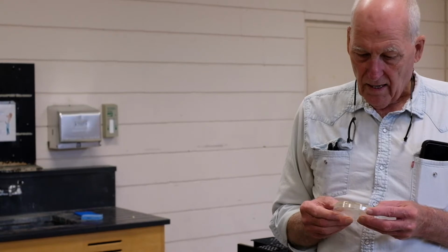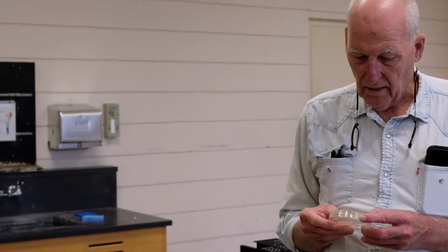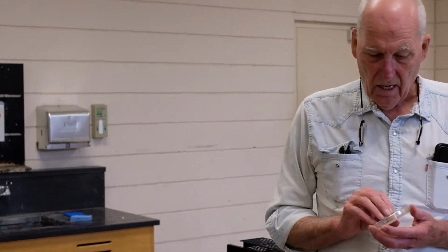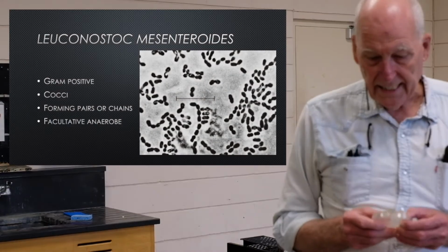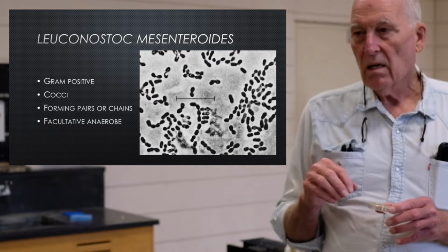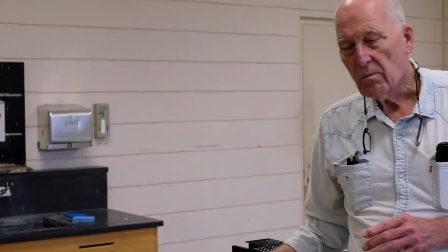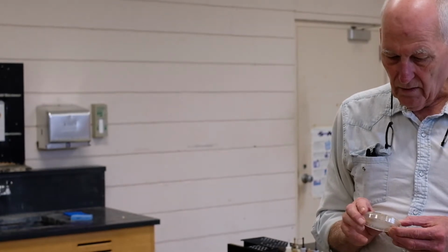So the sauerkraut is 1 day ahead of the cucumbers, but typically the initial organism that we isolate in sauerkraut or cucumbers is an organism called Leuconostoc mesenteroides. It gives it a kickstart, produces so much acid, and then if the acid gets high enough, it's going to die off, and the second group of organisms is going to pick up.